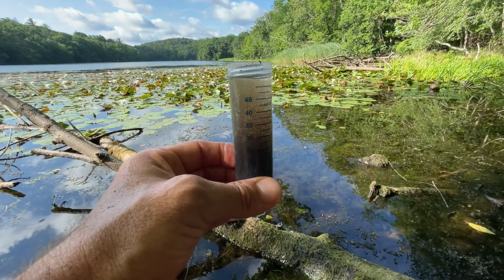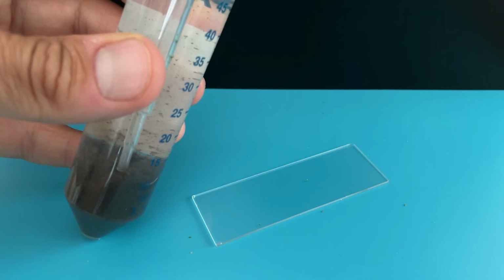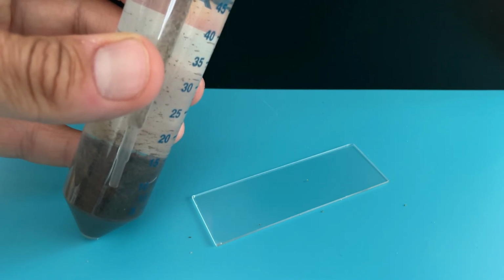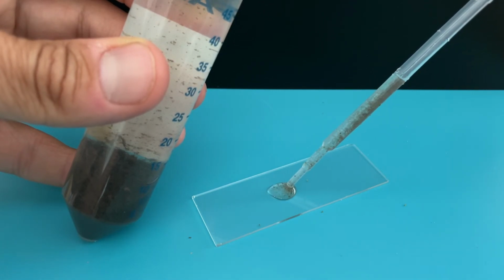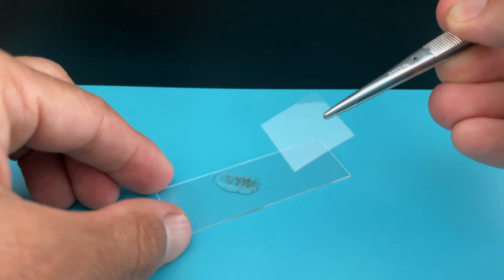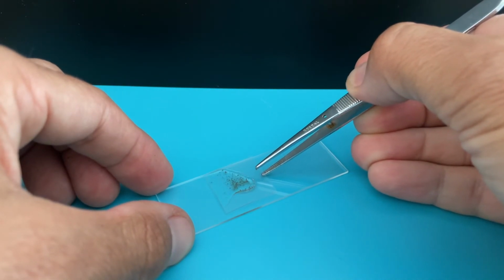Let's go home now. Let's see what creatures we see in this little drop of water from the lake.